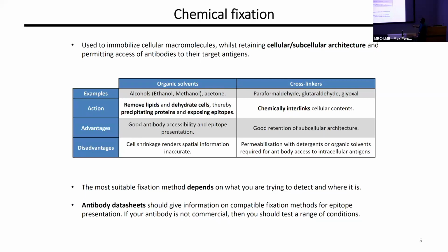Of course, the disadvantage of cross-linkers is that you then need permeabilization, so the antibody enters the cell. Here, the epitopes are, as I said, accessible. So every technique has its advantages and disadvantages.